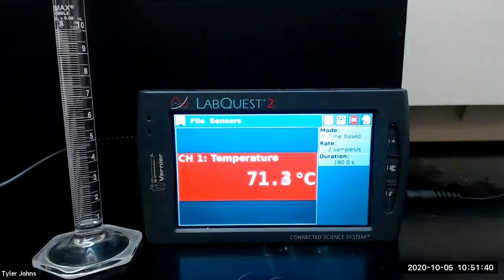We've now collected 0.5 milliliters of distillate, so we will begin recording the temperature every 0.5 milliliters. We've collected 1 milliliter of distillate, so we will now collect the next 3 to 4 drops of distillate in a GC vial.